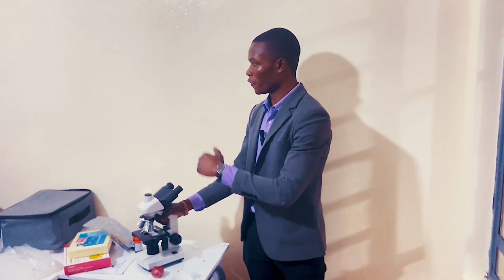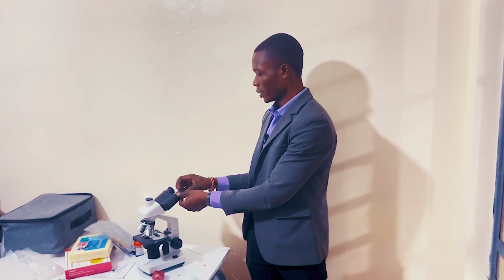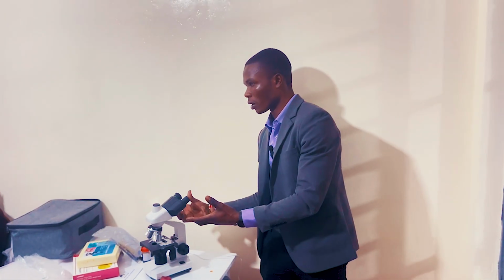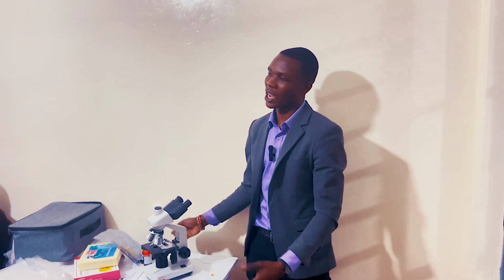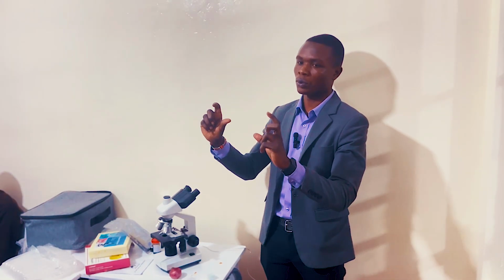Now your work is to view. You come to the eyepiece lens. Now you view. It depends on the objective lens you want to use. And also we have eyepiece lenses. They are here. So just rotate the wheel so that you can know which one you want to use to view your specimen. Are we together up to that point?